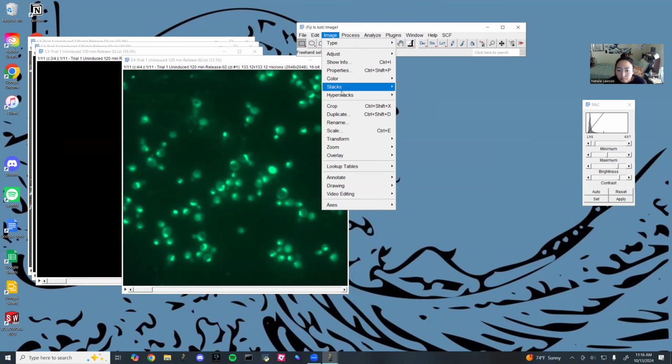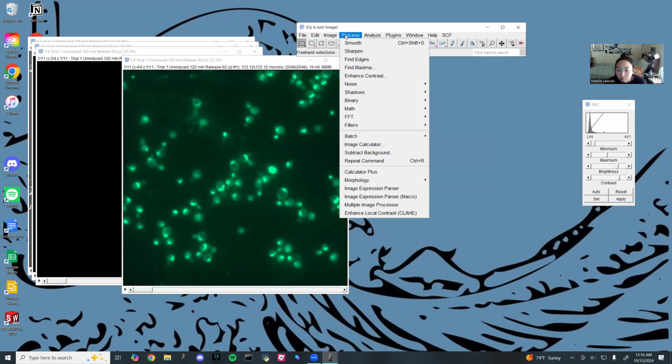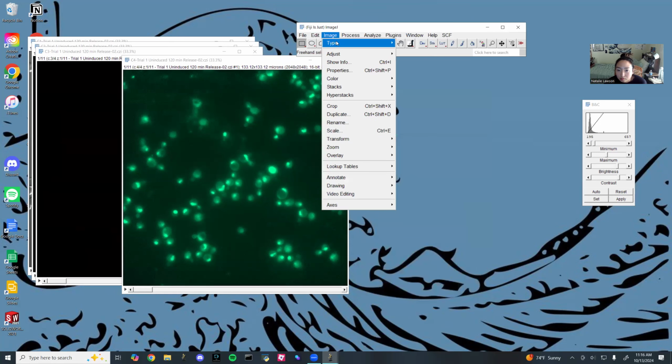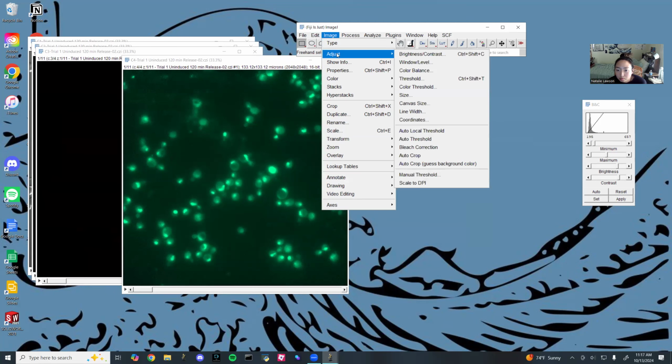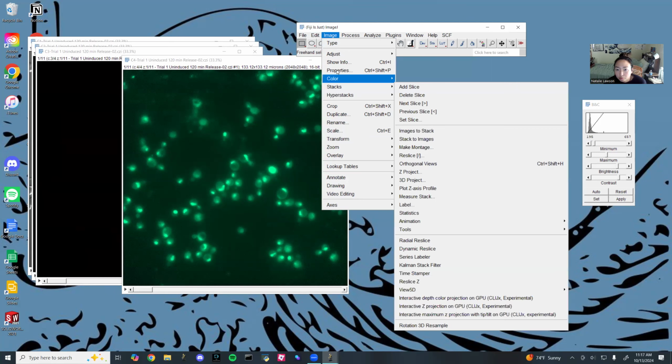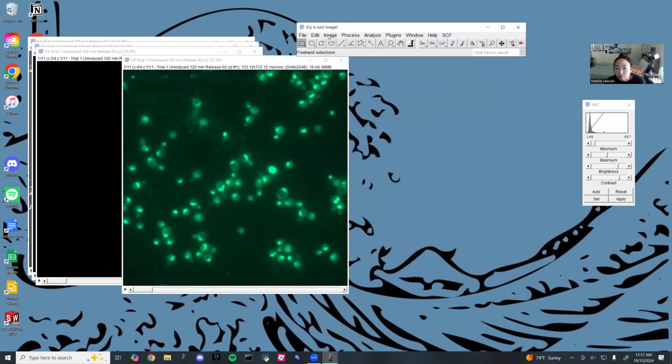Images. Okay, that's okay. There are practice images here somewhere. I forgot exactly where they are, but the videos will show you. And I think what's more important to practice is CellProfiler. So let's open that.